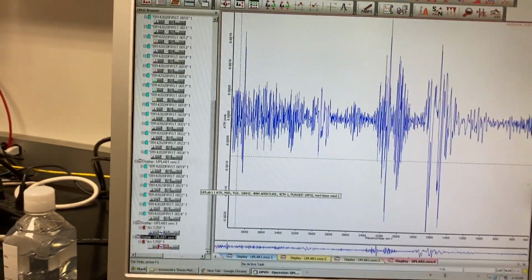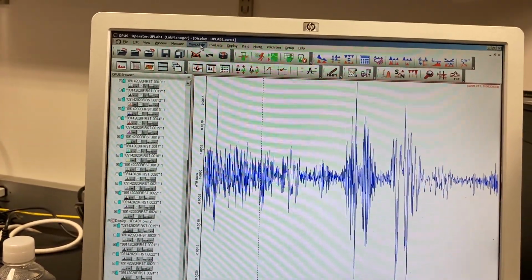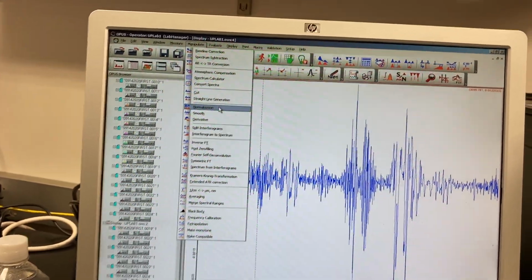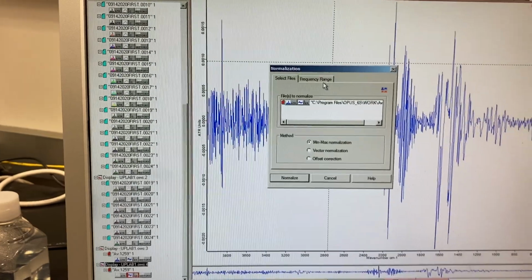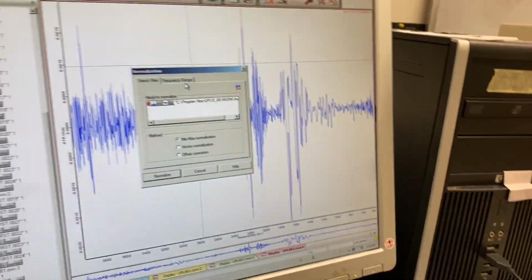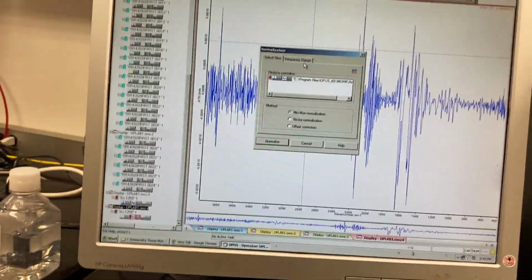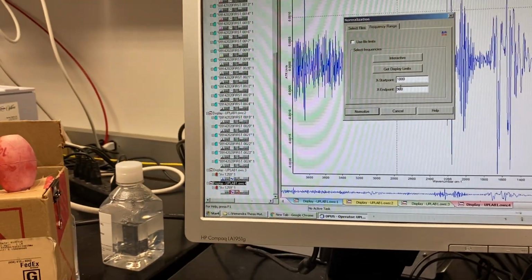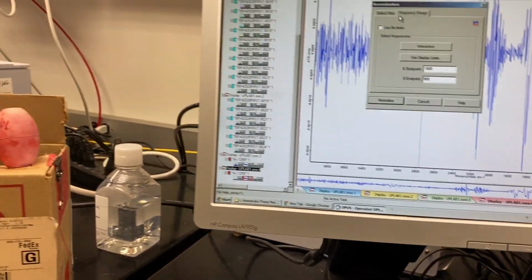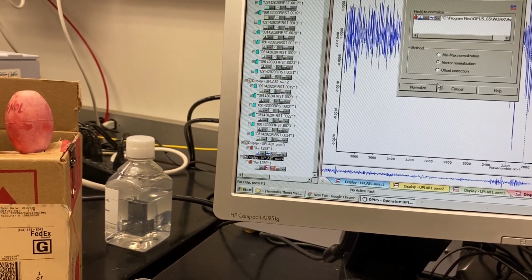So this is the vector normalized data. Select this one. We have to do the vector normalization. You also have to study what is meant by normalization and why you need it. Otherwise, it will be like spoon feeding. If you explore it yourself, then it will be better. Generally for normalization, you select 900 to 1800. We have to do the vector normalization for the second derivative.